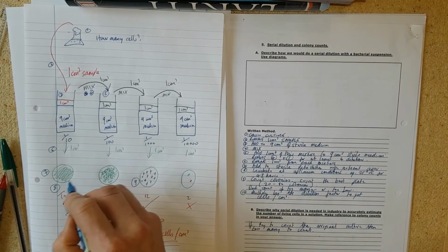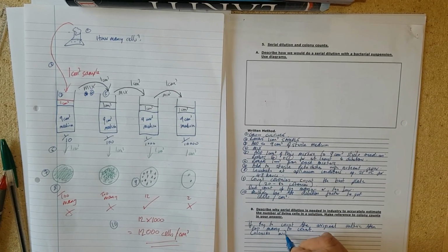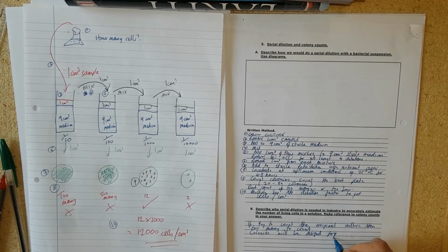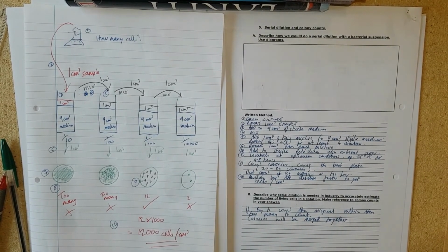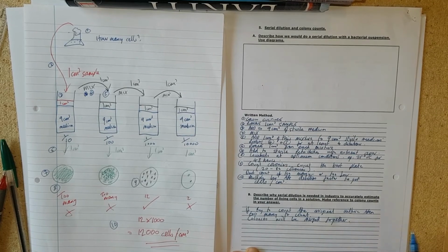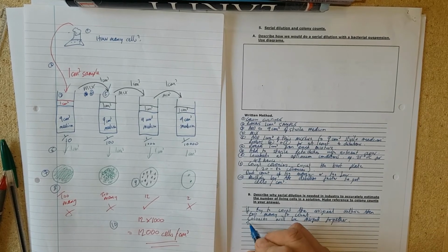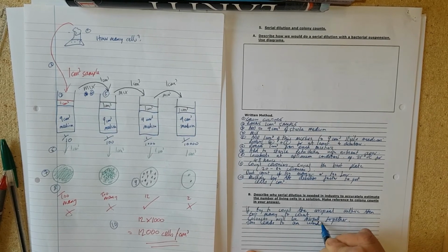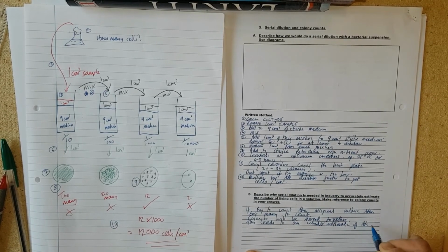These colonies will all be merged together. This would lead to an underestimate of your count. So your number won't be high enough. So this leads to an underestimate of the count.